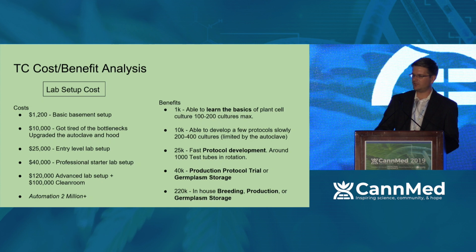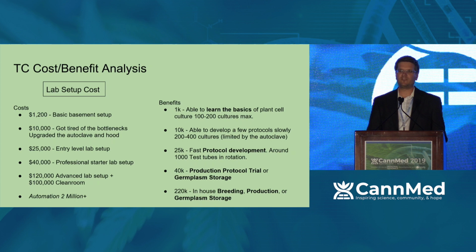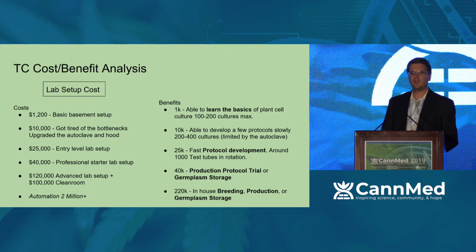And if you start at the low scale, your equipment does not become obsolete over time. You can still use the old hood and the old autoclave as you expand to a bigger lab to get the results that you're really looking for. So with that being said, I have a couple more minutes here, and I'm curious if anybody has questions. I'd love to take some.